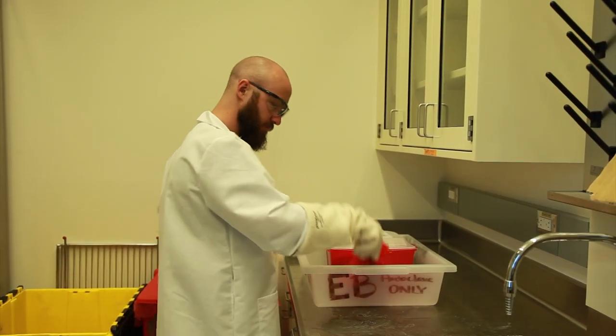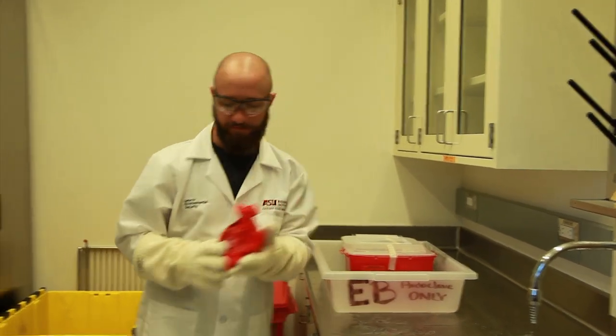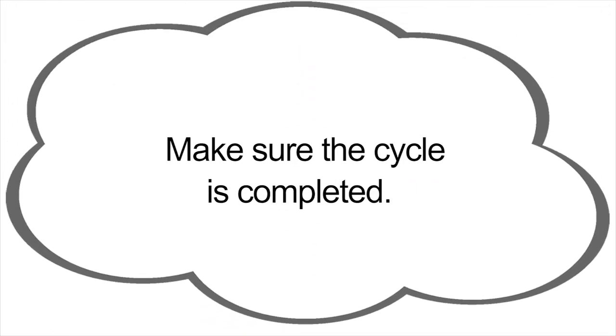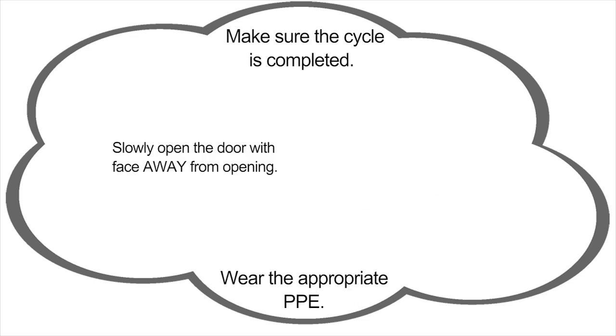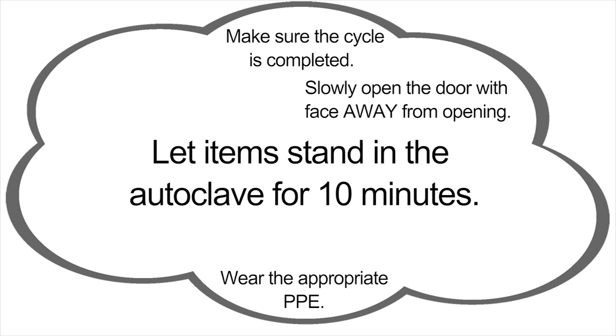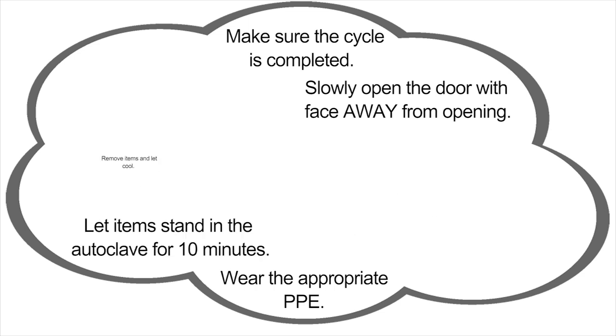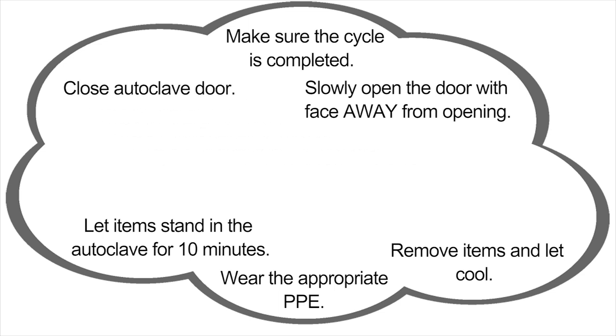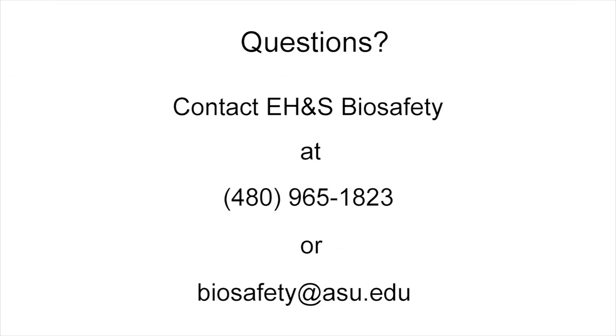If waste was in the autoclave, note that all biohazardous material must be processed according to the ASU guidelines. To summarize unloading an autoclave: make sure the cycle is completed. Wear the appropriate PPE. Slowly open the door with face away from opening. Let items stand in the autoclave for approximately 10 minutes. Cautiously remove items and let cool. Close autoclave door. Sign the autoclave logbook. Dispose of waste properly.